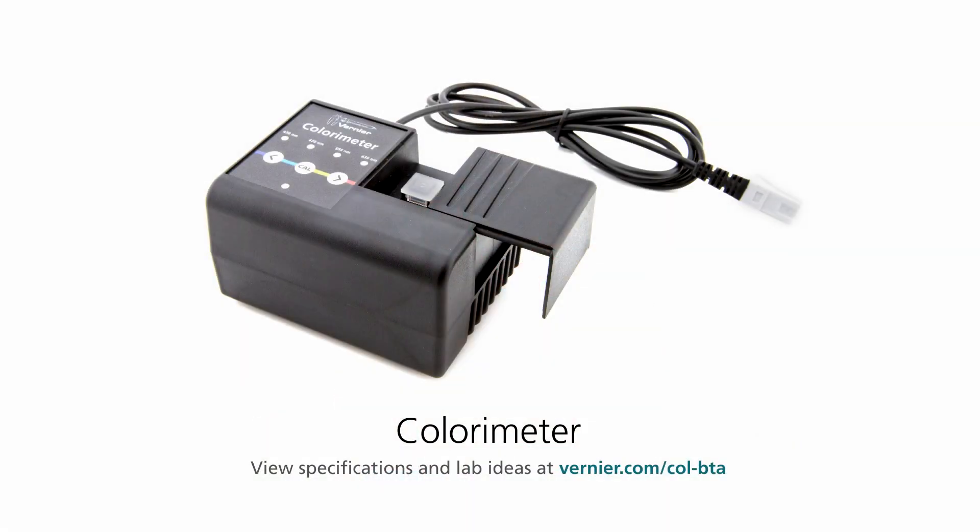In this short video, I will introduce the Vernier Colorimeter and demonstrate how to set up the colorimeter with LabQuest 2 for a Beer's Law Experiment.